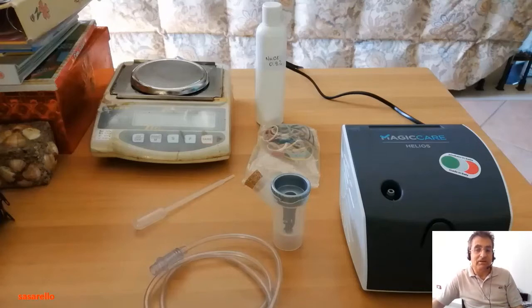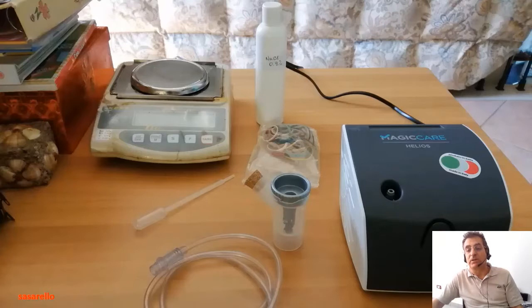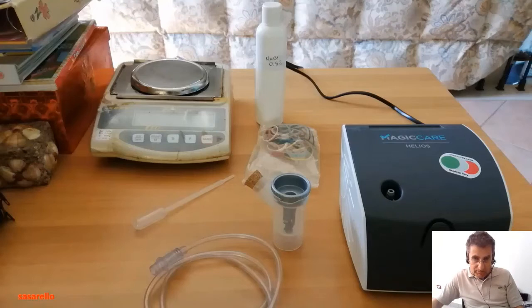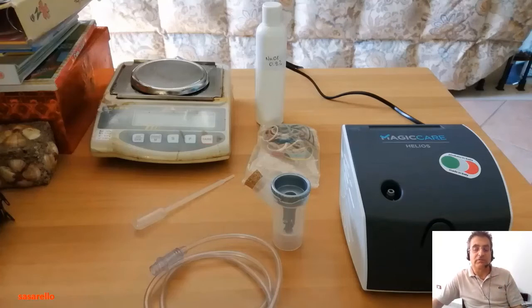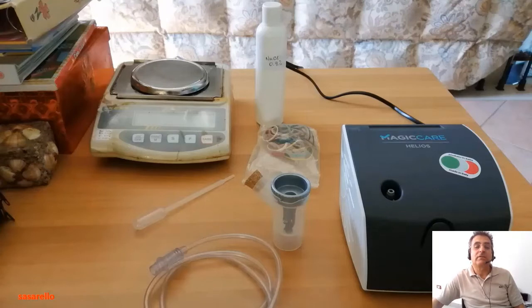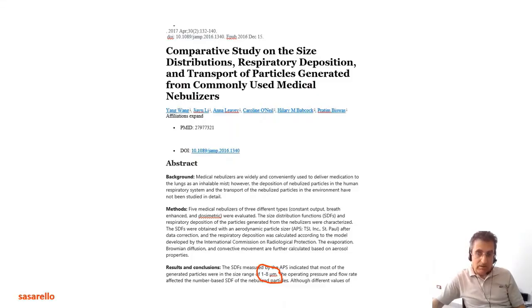The equipment is very simple and is based on the use of a common nebulizer that is used domestically to deliver drugs to the lungs. In this case I used a nebulizer based on a mechanical pump. The nebulizer has a chamber where you put the fluid — in this case I use a test liquid solution. Then there are elastic rings, and for a quantitative evaluation you need an analytical balance.